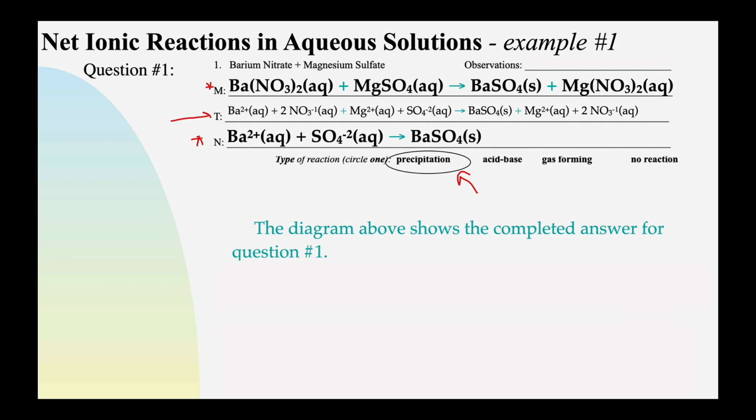Again, just to summarize here, for all of these problems, make sure you write a really good M and N line. M is the molecular equation. It shows all the cations and anions with all their states of matter. The N line is the net ionic line. It also shows all the states of matter. The ion charges are included, and I want to see what's happening in the lab. And you can tell from either one that this is a precipitation reaction because a solid is forming.